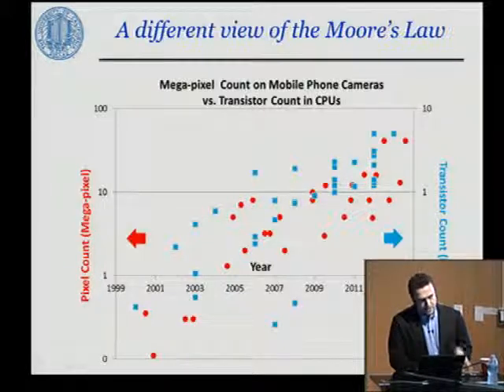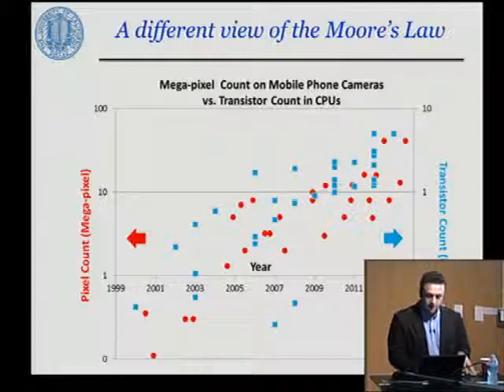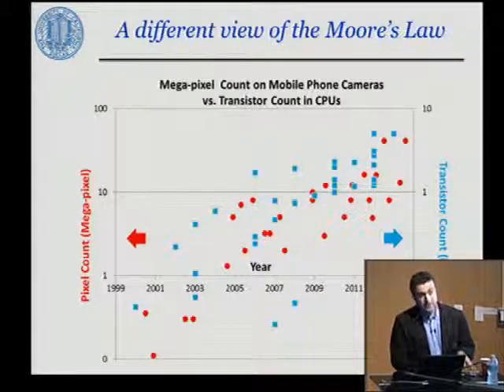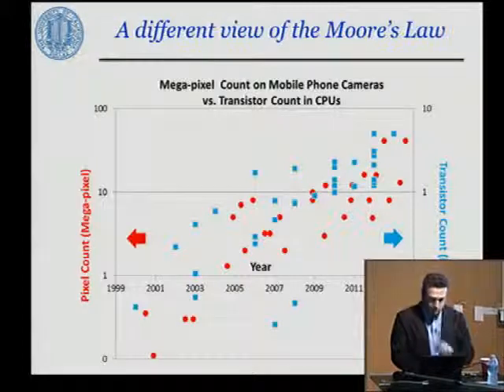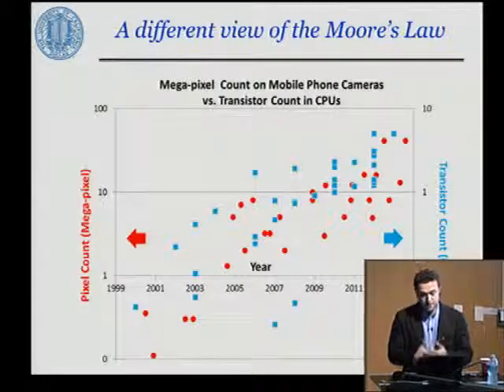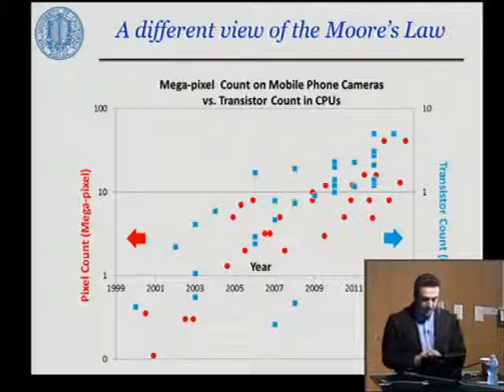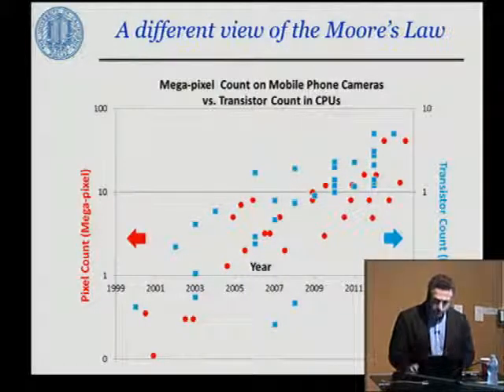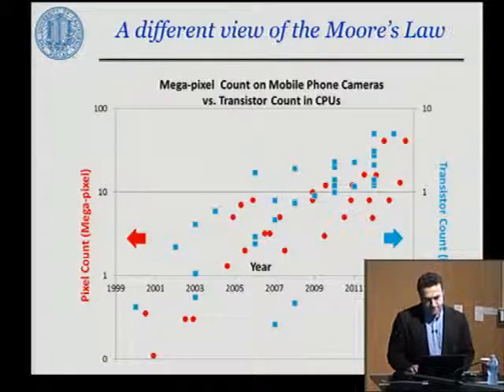This enables us, through the CMOS imagers installed at the back of our mobile phones, to conduct advanced imaging that is cost-effective, field-portable, and very competitive in terms of the space bandwidth products you can get. That's quite unique, and it wasn't expected, but it's a remarkable advancement that is helping computational imaging techniques.